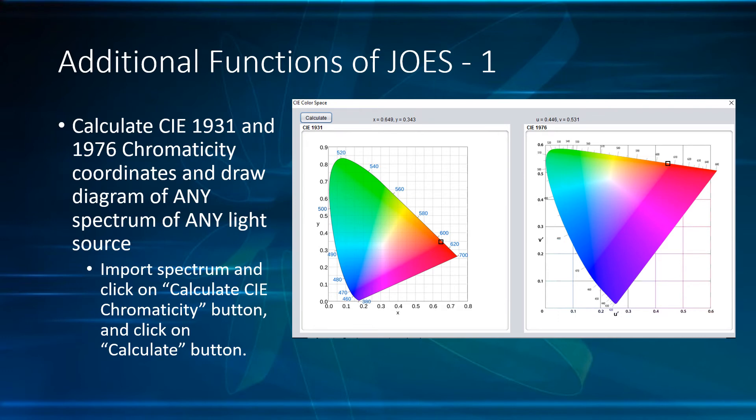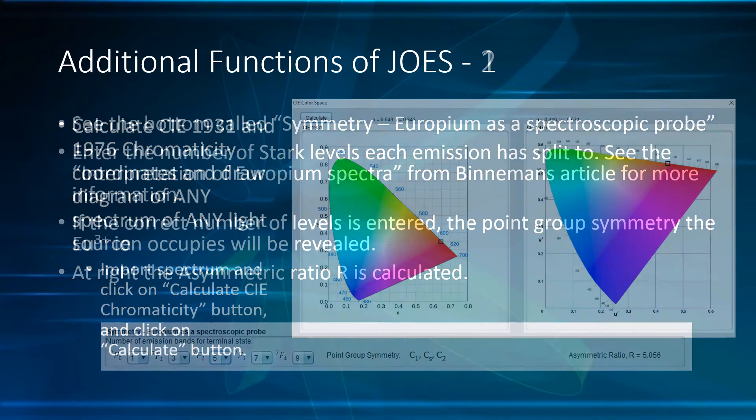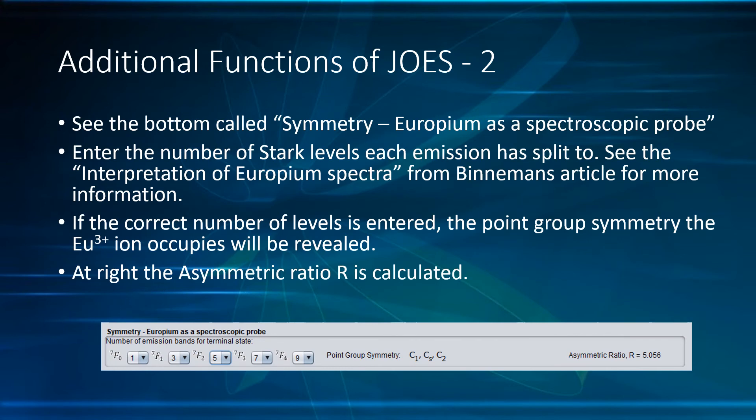Just import the spectrum and click on the blue button and once again on the Calculate button. If the spectrum is well resolved, you can see the number of peaks that exist for each transition. These are called the Stark levels, and they appear due to the crystal field splitting. In this way the symmetry around the Europium ion can be estimated. Also, the asymmetric ratio is calculated.